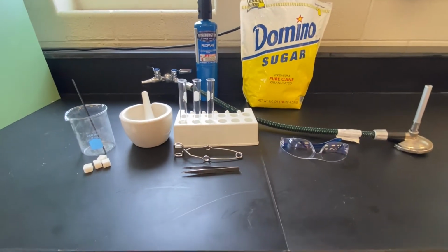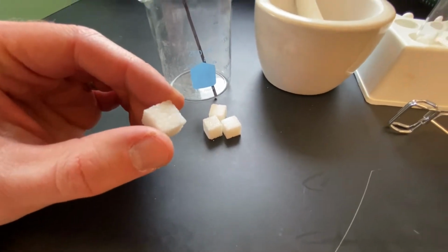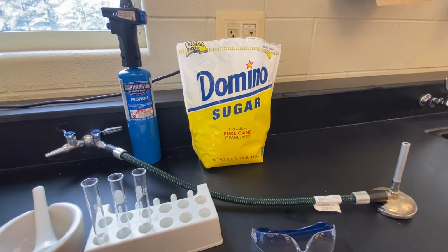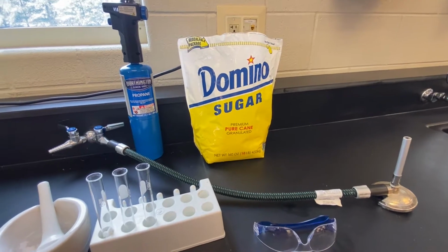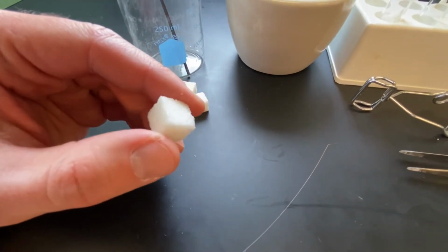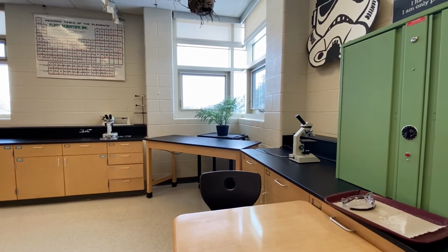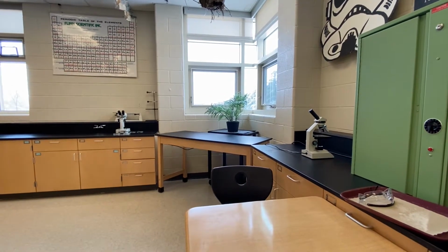So here's what we're going to be doing. These over here are sugar cubes. All it is is sugar that you're used to seeing granulated, in little tiny irregular chunks. They look like specks, but if you look at them up really close, they're like little granular chunks. It's all been packed together into this nice little neat cube, so that's what we're primarily going to be working with. Oh, I almost forgot. Over here on this side of the room, I have a microscope and stereoscope set up just in case we wish to view this underneath a microscope or stereoscope, to see it a little bigger.